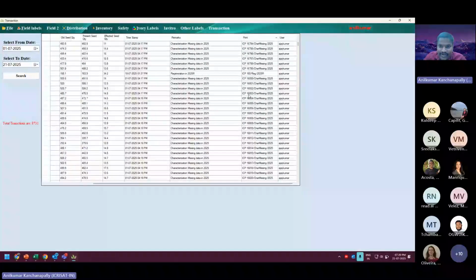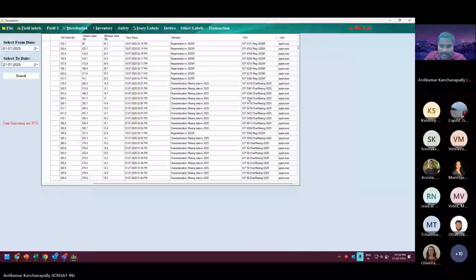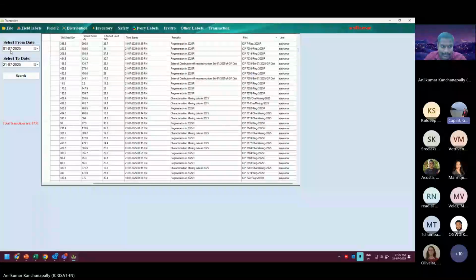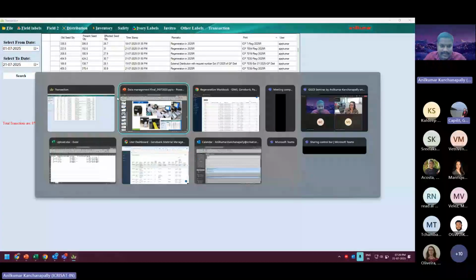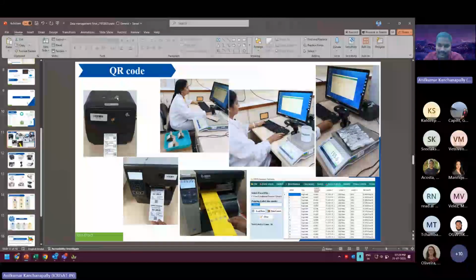Thus, that new weight will replace the existing weight. Oh, so you mean the entry with the 10 grams remaining will be deleted? Yes, that will be removed from the database, and the seeds also, we are discarding the existing old seeds. We will discard it.